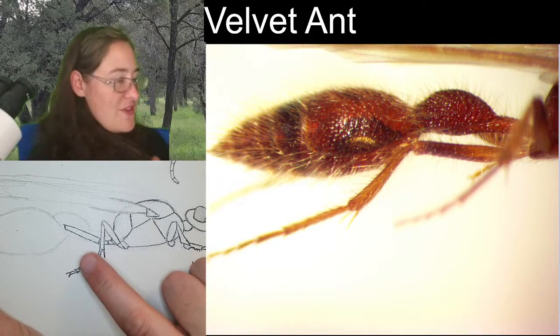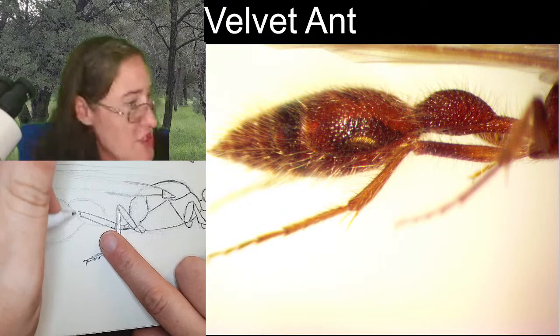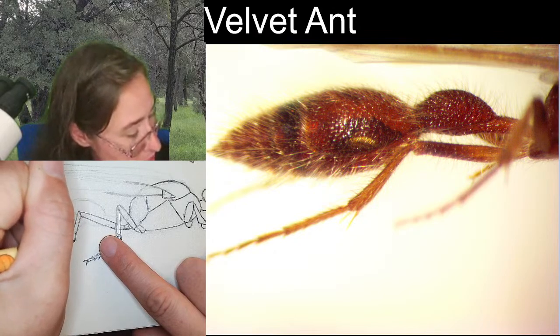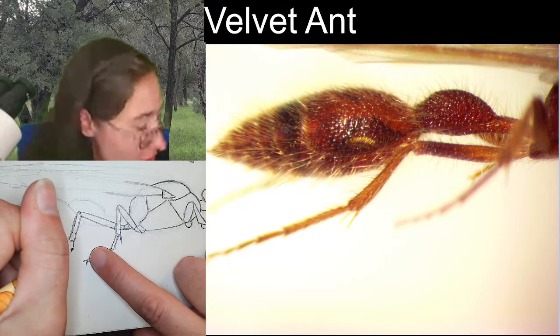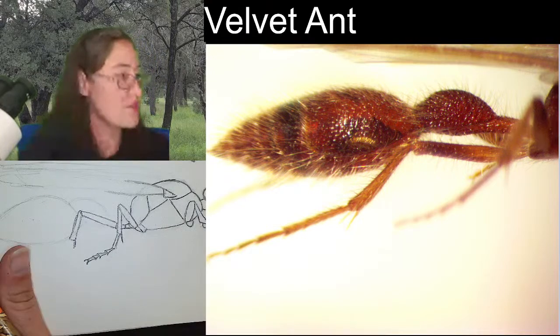Now the tibia is actually short in comparison to what you would think. It's going to be coming down, and it looks like it gets wider at the base and wider at the tip this time, by just a little bit. And then you have the tibial spine, of course. And then you have the tarsal segments.